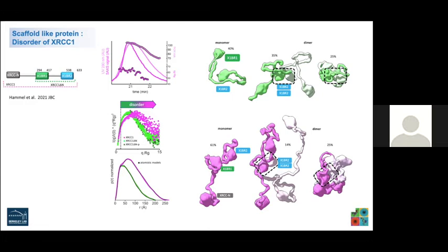Yeah. We have some based off of E2P and lumazine synthase that are much bigger, and those are 60-mers. Plus we have the antigen put on them. And some of them we've done with things like the large spike proteins, and that really pushes things very, very big.